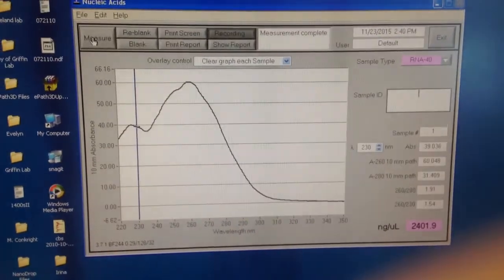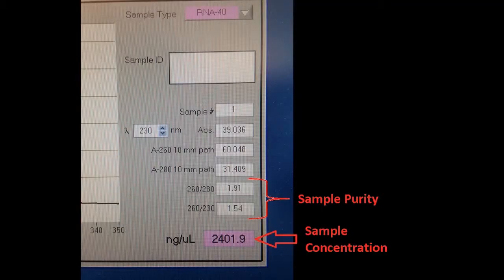You'll end up getting something that looks like this, where you can analyze the purity of your sample and record your sample concentration.